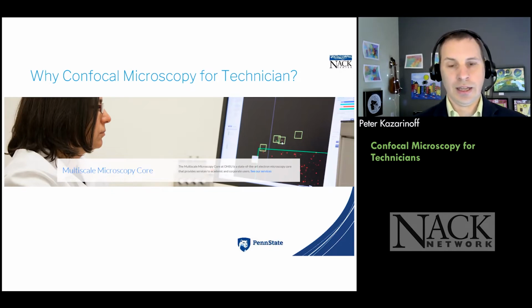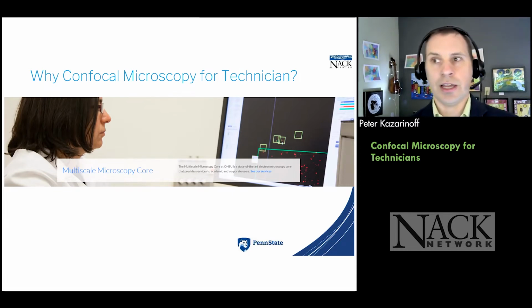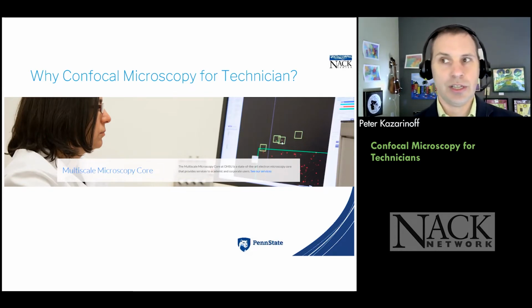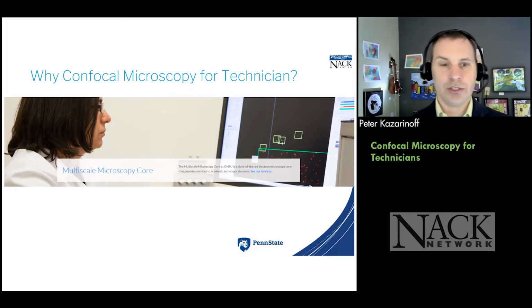The answer that we found up in Seattle, as well as here in Portland, is that in a lot of medical imaging centers at hospitals, as well as biological imaging centers, they're going to have both scanning electron microscopes and transmission electron microscopes that we were training our technicians to use.